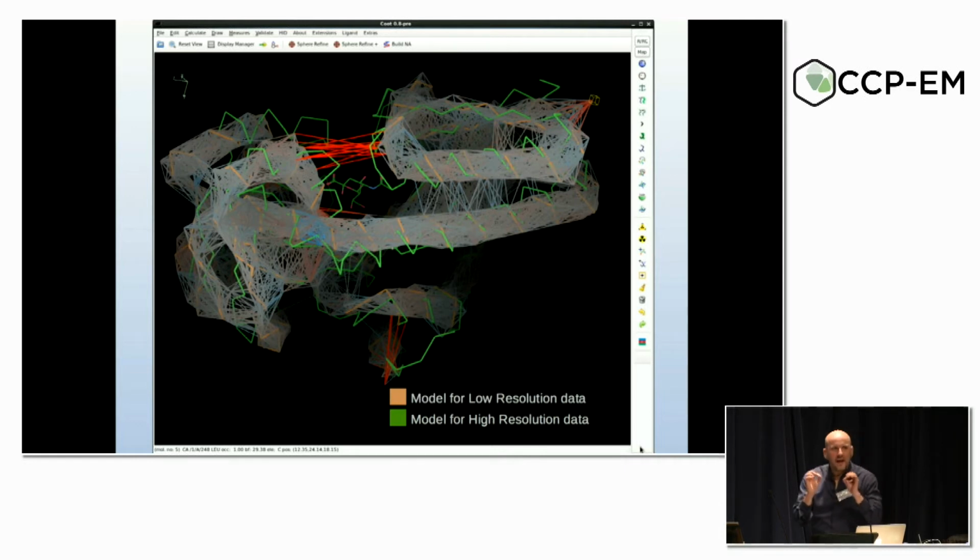What we're trying to express with this particular figure is that around the ligand binding site, we have additional information where it's quite clear to us that we don't expect conservation of backbone distances around the ligand binding site upon ligand binding.